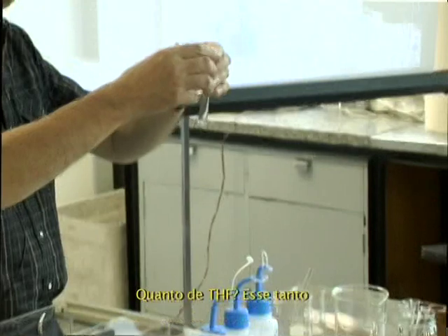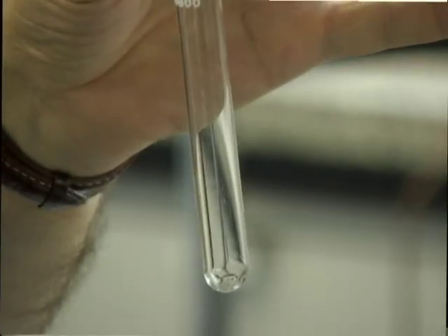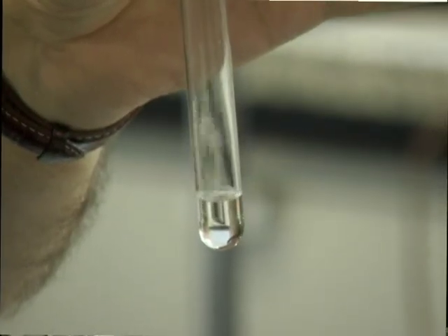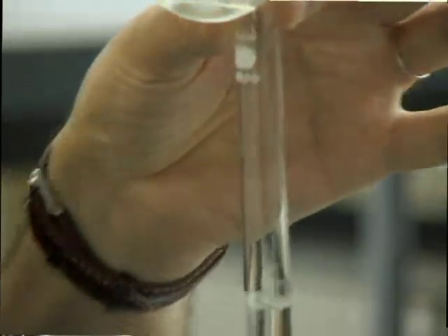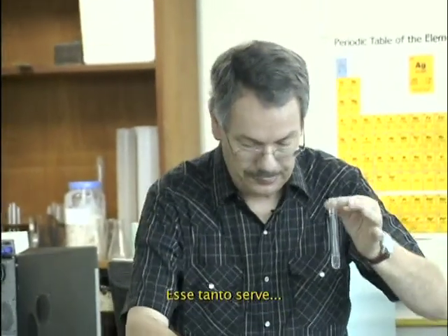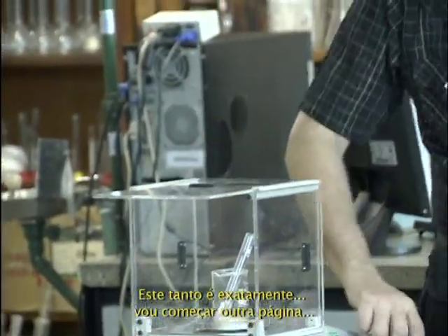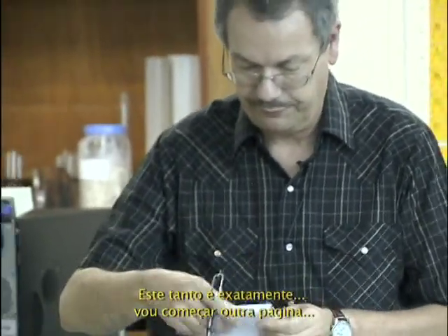How much THF do you put? This much. That's too much to put everything. This much, for example, will do.